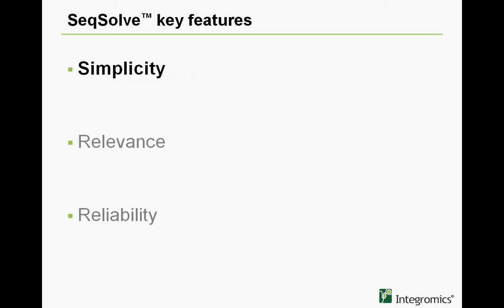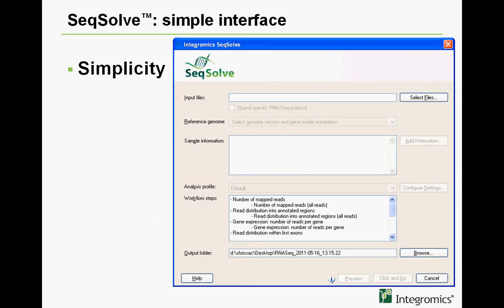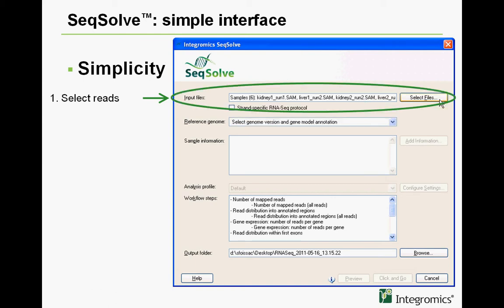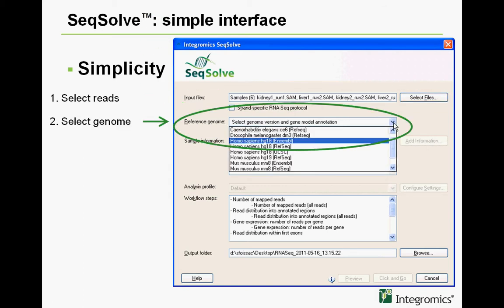First, simplicity. SeqSolve is extremely easy to use. This is the main interface of the RNA-seq workflow. To run an analysis, you just need to select your input files, which are mapped reads, usually in SAM, BAM, or BED format, indicate the genome you're working on, and your favorite gene annotation, for instance RefSeq or Ensembl, and that's all — you're ready to go.